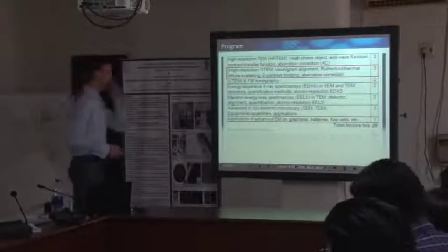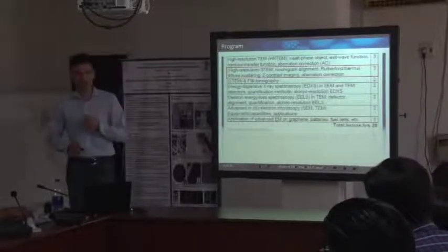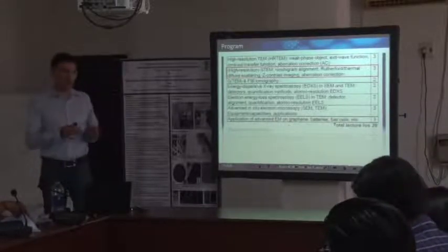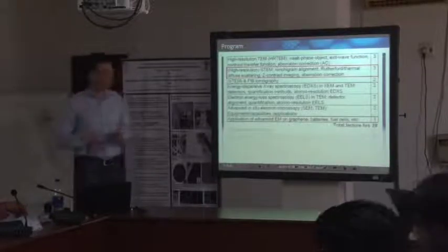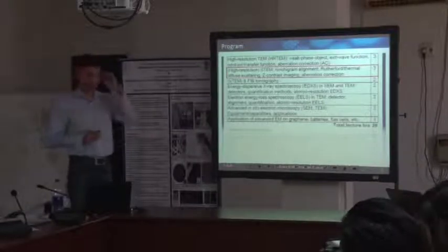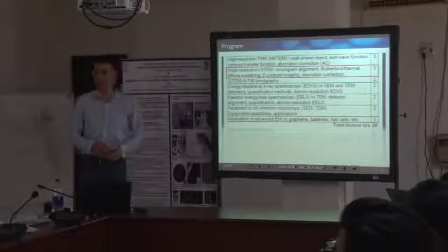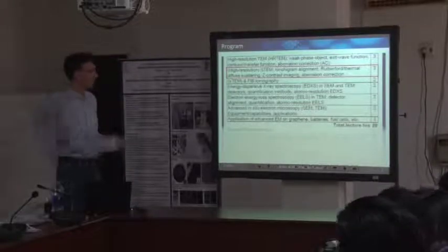very early part. I'm going to present some information about the scanning procedure, because there are some fundamental differences between a scanning electron microscope and our transmission electron microscope. So the scanning is more elaborate. I'm going to talk a little bit about the fundamental or critical basics behind Z contrast imaging, similar to backscattered electron imaging.